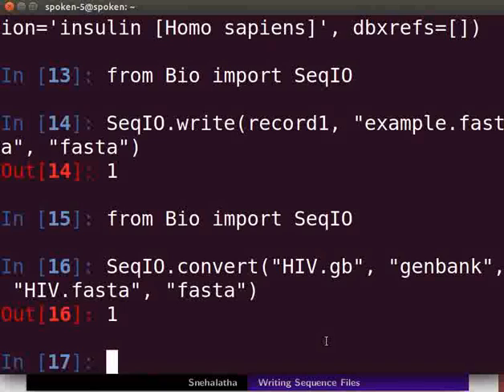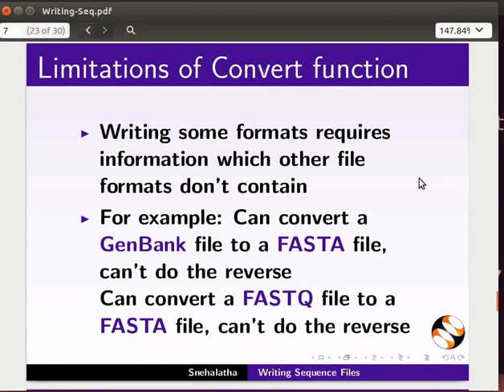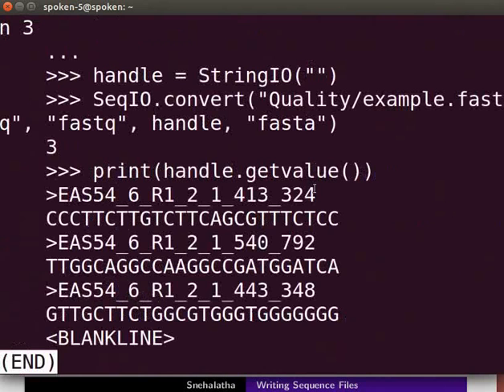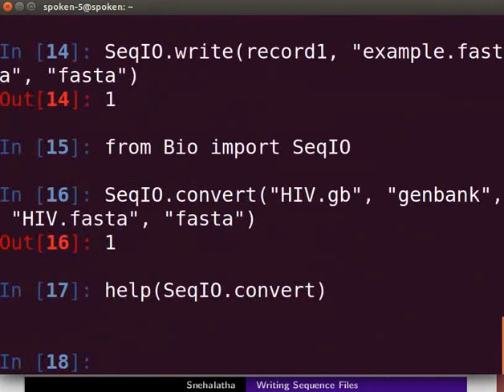Even though we can convert file formats easily using the convert function, it has limitations. Writing some formats requires information which other file formats don't contain. For example, we can convert a GenBank file to a FASTA file, but we can't do the reverse. Similarly, we can turn a FASTQ file into a FASTA file but can't do the reverse. For more information regarding the convert function, type the help command and press Enter. Press Q on the keyboard to get back to the prompt.